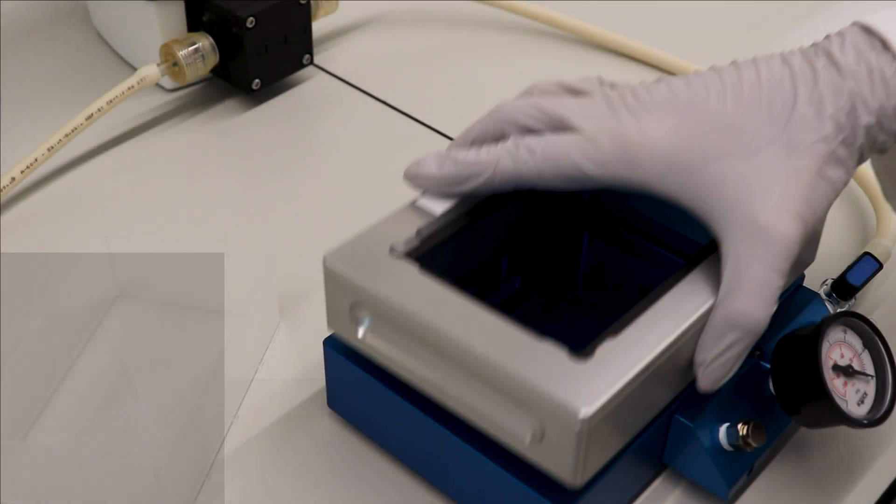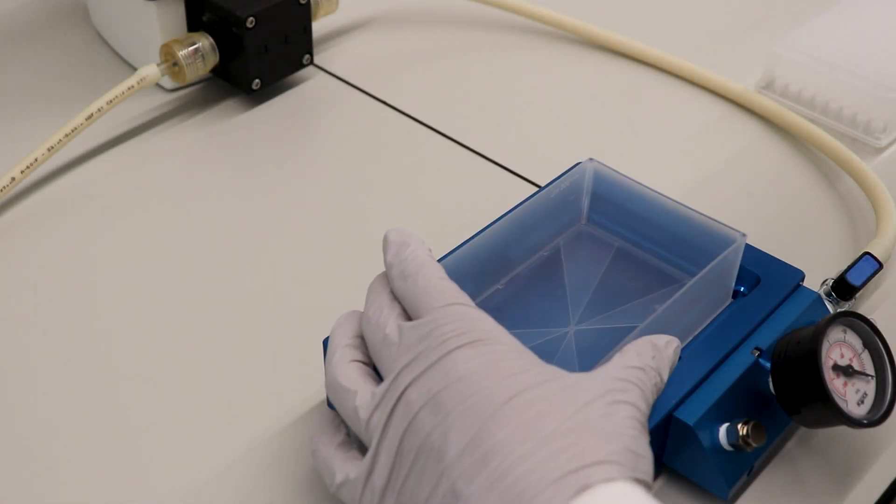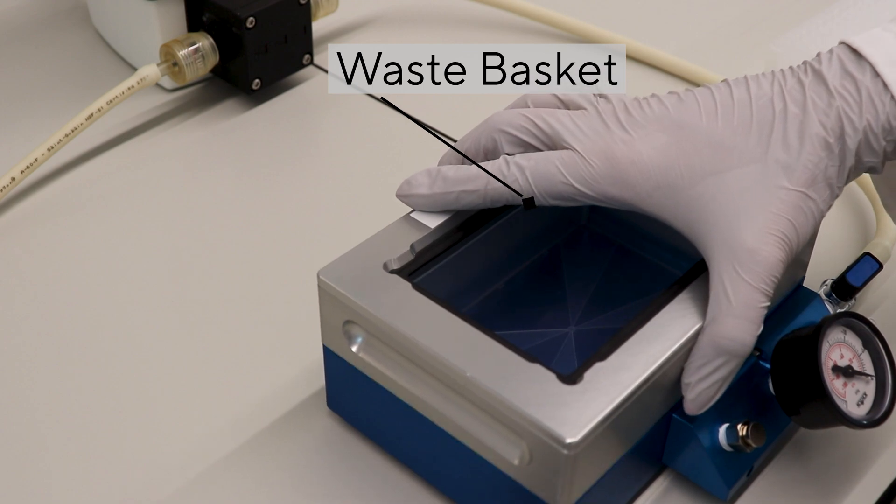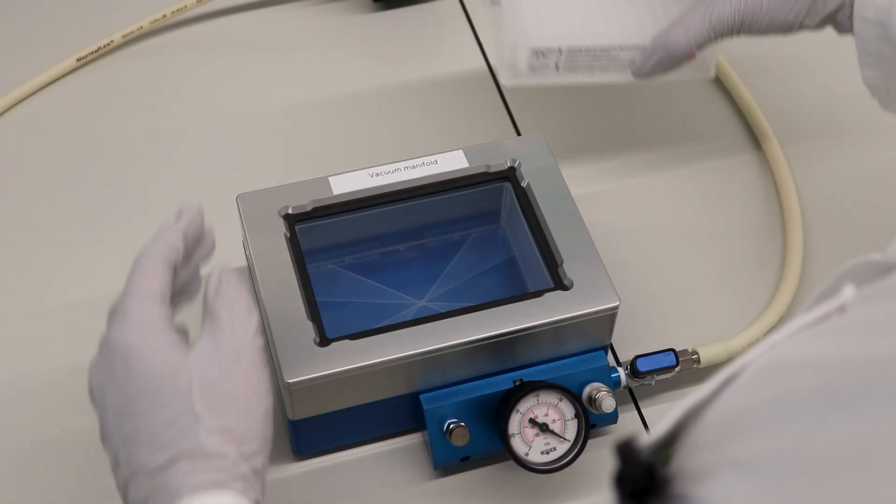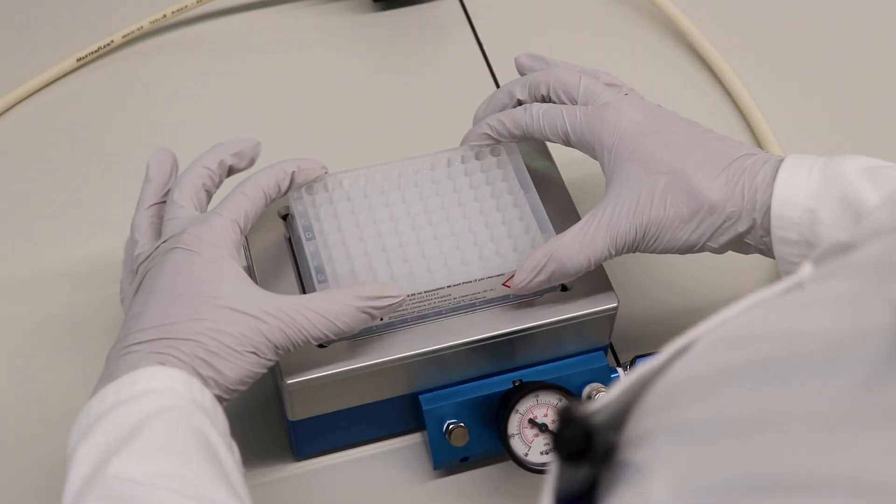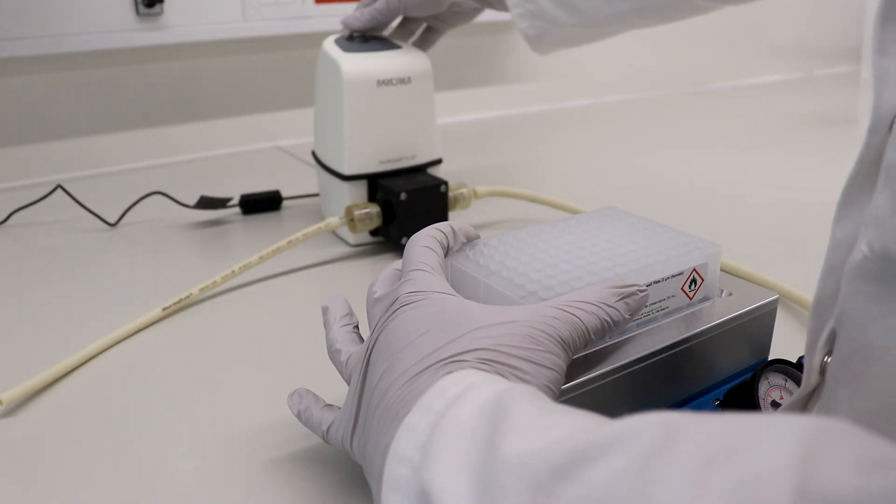When operating the plates with vacuum, begin by placing the waste basket inside the vacuum manifold, followed by the spacer and the plate. Make sure the seal is tight and turn on the vacuum pump.